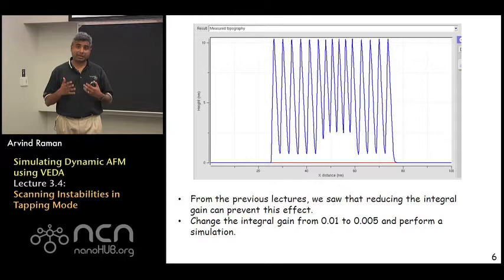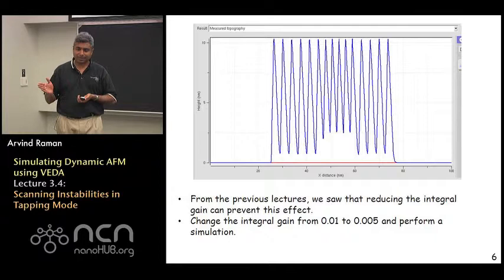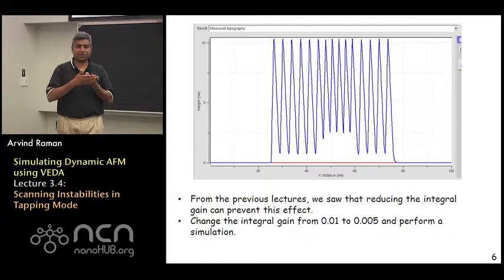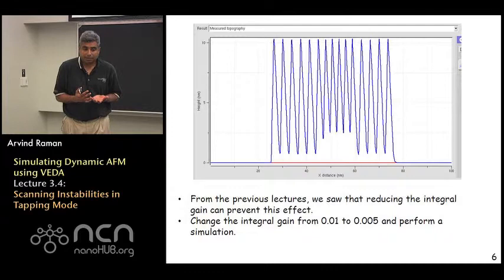However, as soon as we hit the feature, something pretty dramatic seems to happen here. We find the z controller is moving up and down by a very large amount, several nanometers, trying to keep the amplitude constant. And this very jagged profile would appear, you can imagine, if you were doing an image, it would appear as a sequence of ridges, a whole bunch of ridges as soon as you hit this sticky feature.